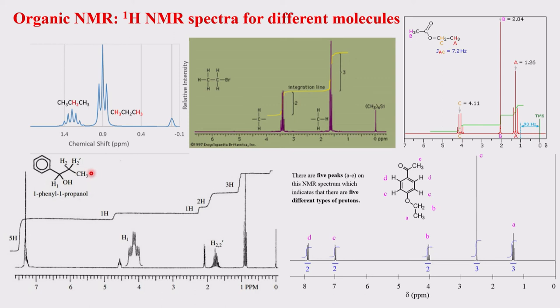So, this will couple into 4 lines. This will couple into 2 lines, all these have come into that. And between themselves also there is a kind of a difference. So, therefore, a huge multiplet is coming, but the intensity area comes to the 2 hydrogens.